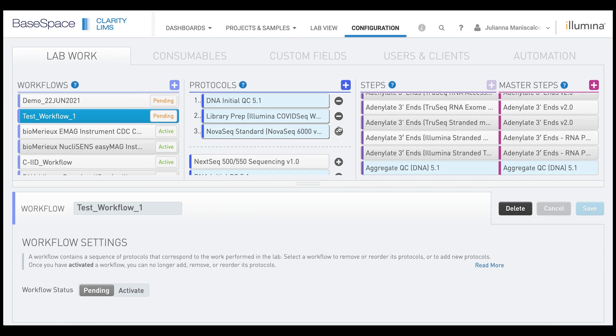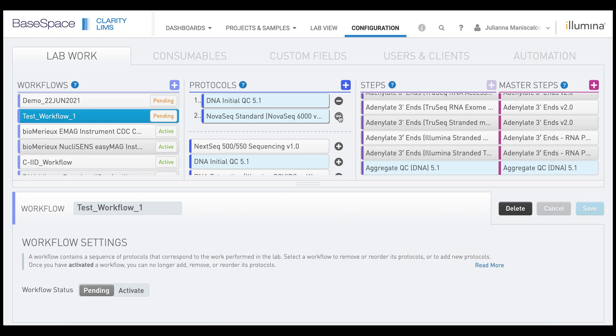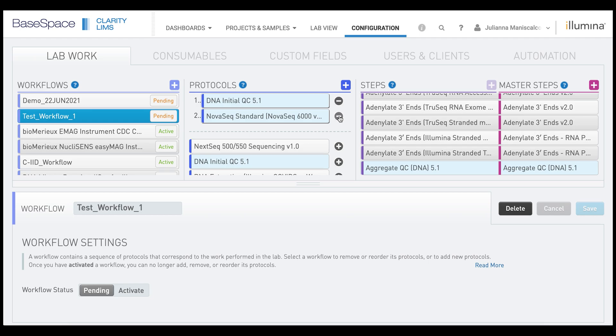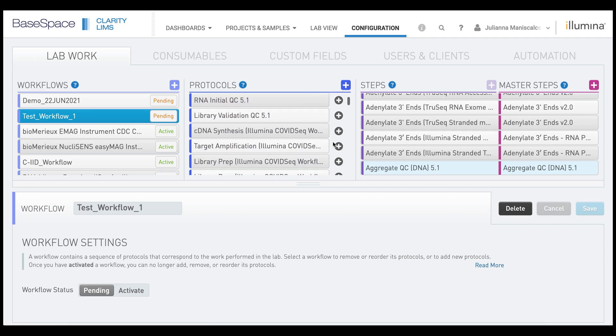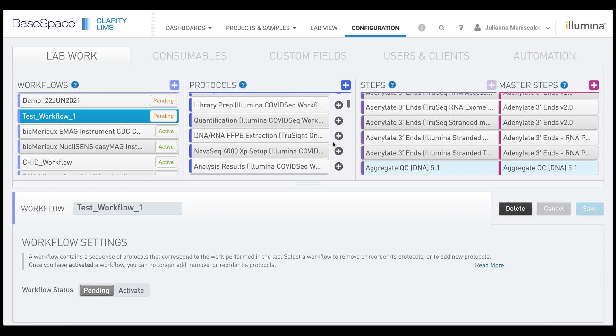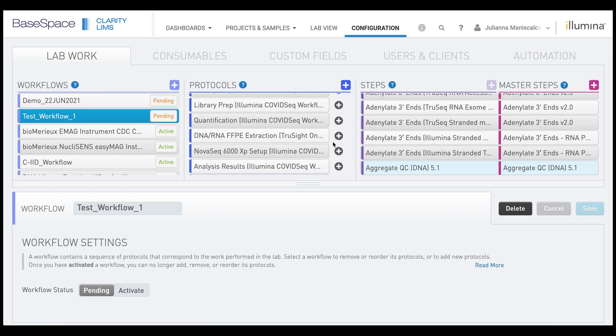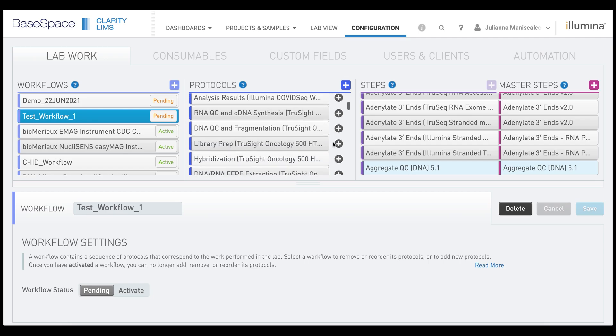If you made a mistake, you can click the minus next to the protocol name and it will remove it from the workflow list. You can then also add additional protocols to this workflow.